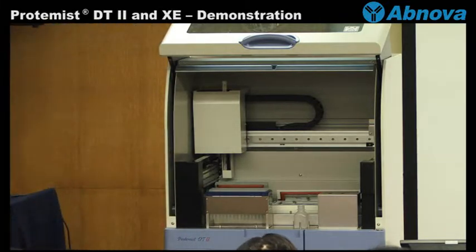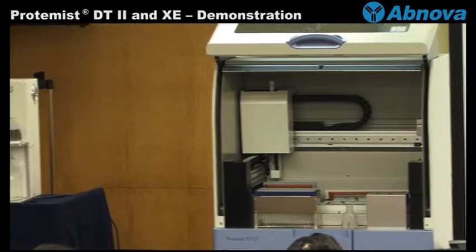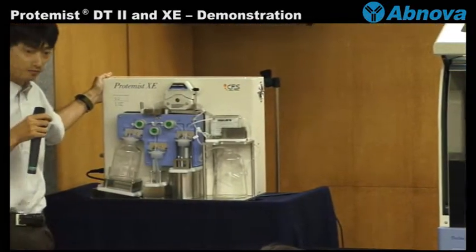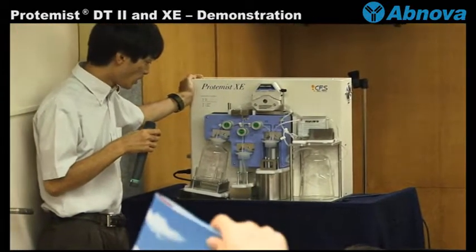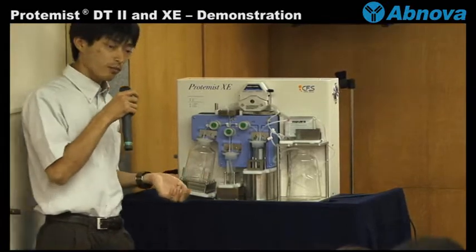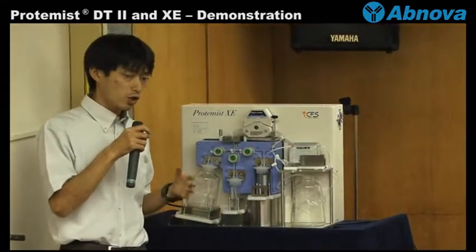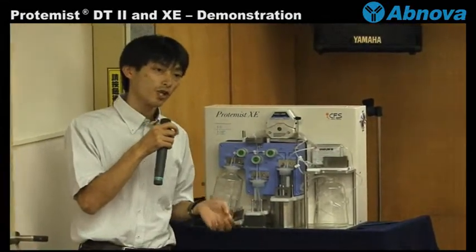Next, I'm going to introduce the XE, the small robot. After preparation of the plasmid DNA, you should do transcription reaction by yourself manually.